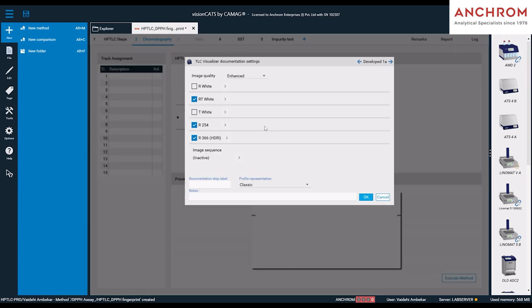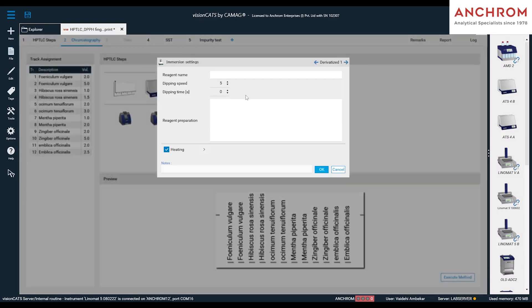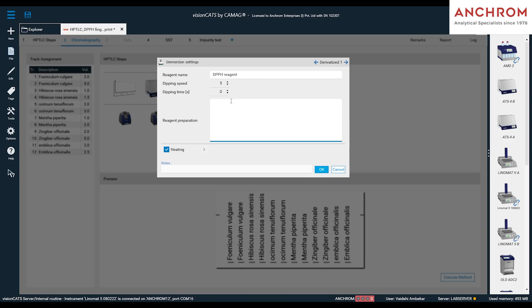Click on the Visualizer 2 icon again and select the illuminations in which you need to capture the developed plate image. Next, click on the Immersion Device and enter the details of the reagent to be used for the analysis. Then, select the parameters in Visualizer 2 icon in which you want to capture the derivatized plate image.